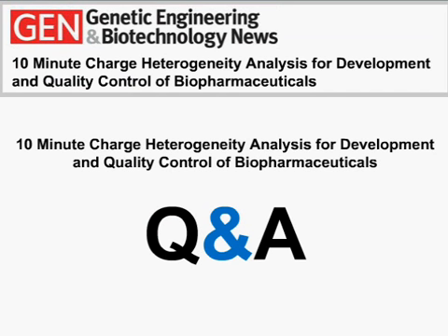And Scott, someone may have missed part of the webinar. He says, maybe I missed it, but what is the minimum protein concentration required? Also, what kinds of excipient interference do we need to watch out for, for example, between salts, et cetera? The most important thing is to maintain an ionic content less than 15 millimolar PBS.